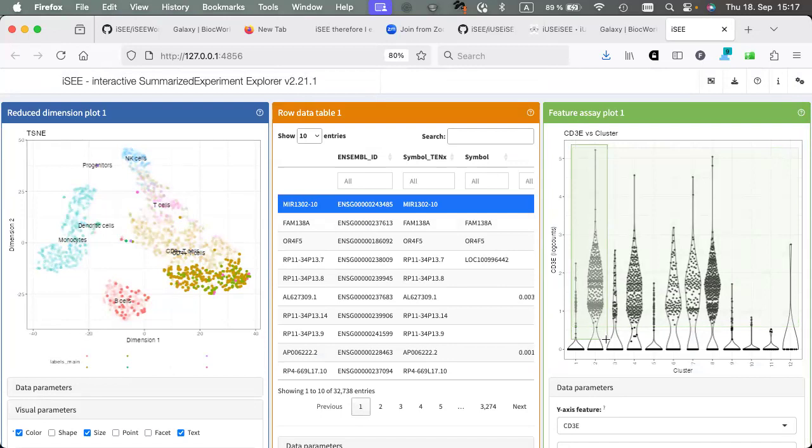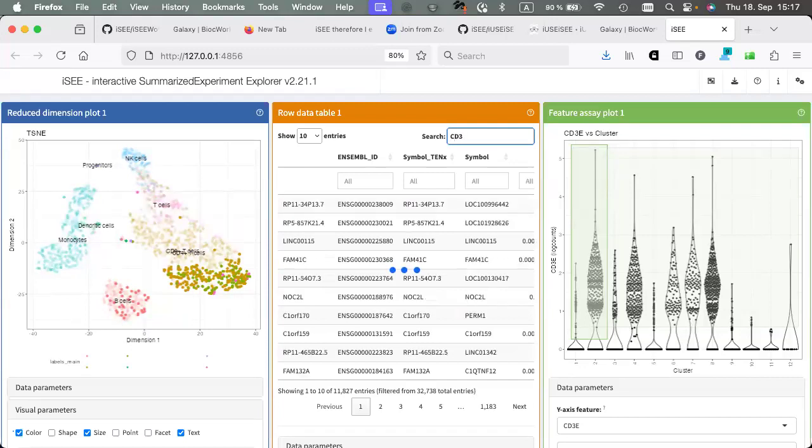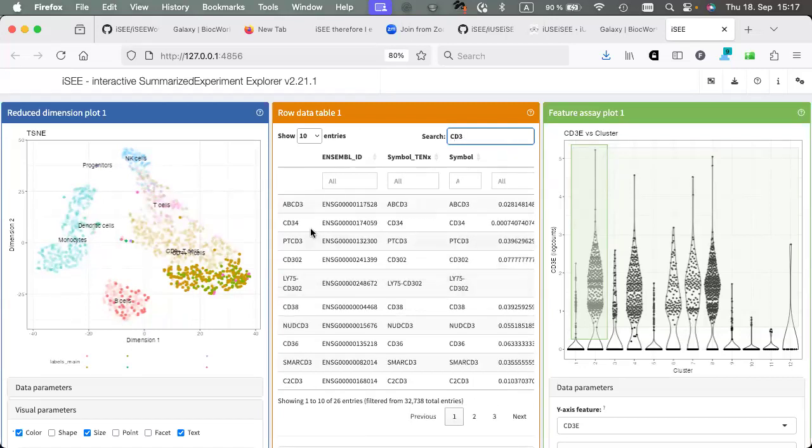I can actually make it more convenient. Who's working with immunologists of you? Who's liking immunologists? Who's not liking immunologists because they always have CDs everywhere? So CDs, their rooms might not be so tidy, but they might have CD3 something, CD34, for example, and they want to plot CD34. Can someone try to guess what's happening now?